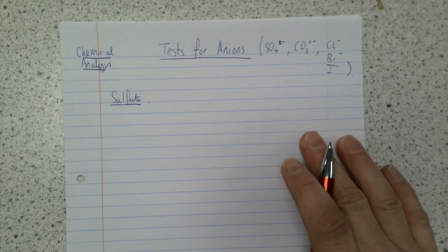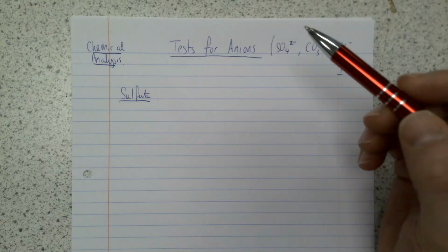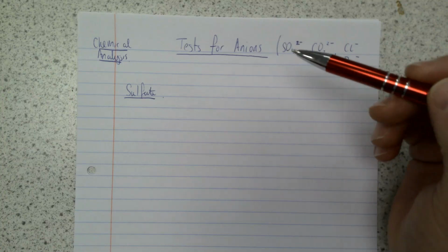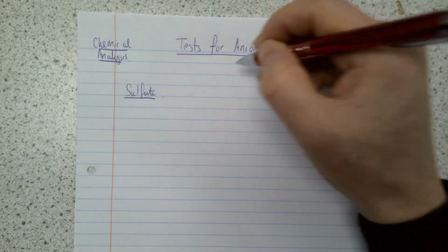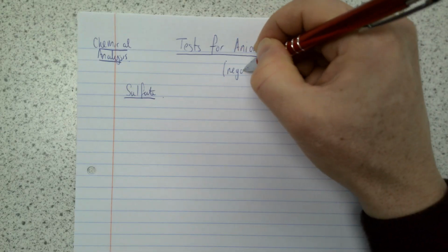Tests for the anions. We've already looked at the test for cations, which was the flame tests and the precipitation test with hydroxide solution. But to identify the formula of a compound, we need to know not only the cations but also the anions. The word anions we don't actually need to know for GCSE, but anions just means negative ions.